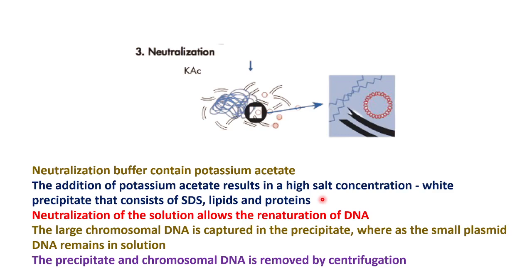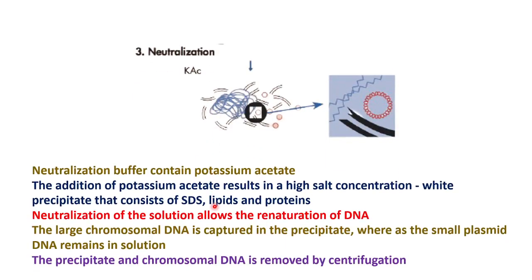The SDS which we added in the lysis step, along with the lipids it removed, and the proteins get precipitated as a white precipitate by the addition of potassium acetate.